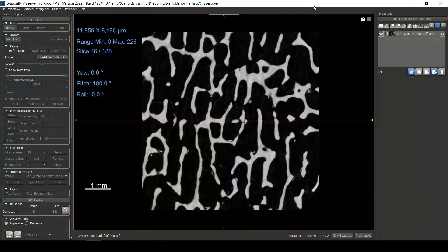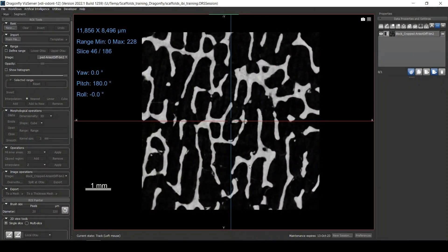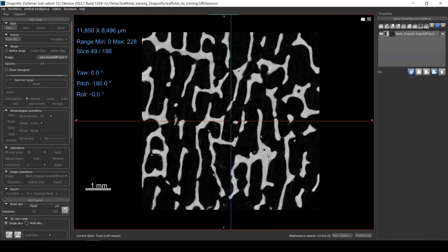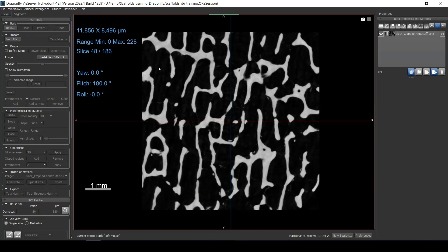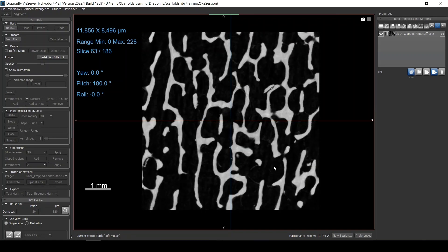Today I'm going to show you how to evaluate the pore space accessibility in a scaffold using Dragonfly. A scaffold is basically a supportive material for bone growth, and because it is implanted or inserted in a patient, it has to allow the cells to access any space inside it so that the new bone can grow inside.